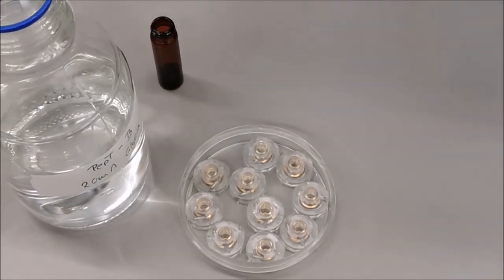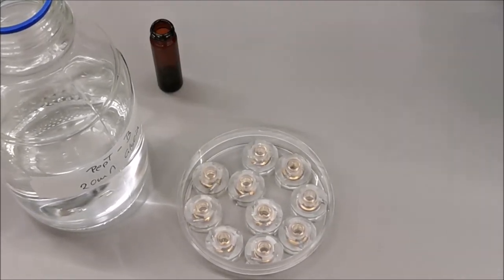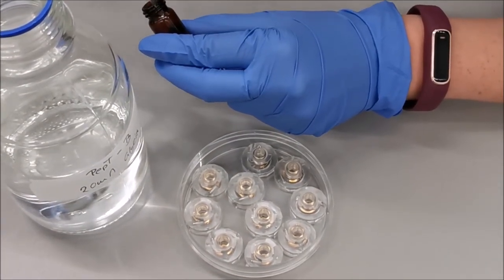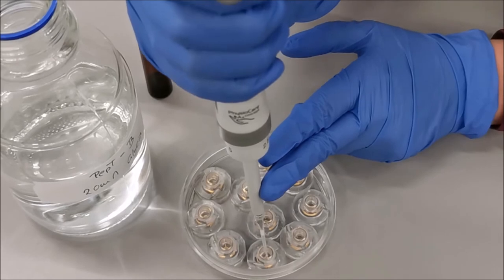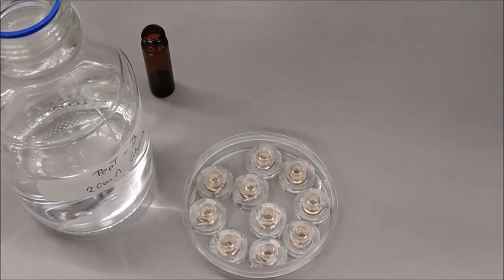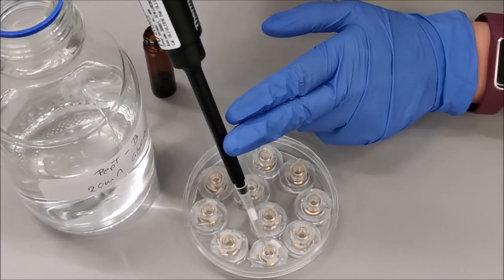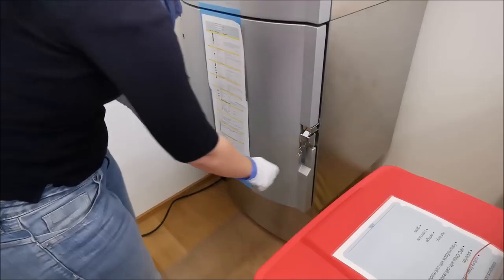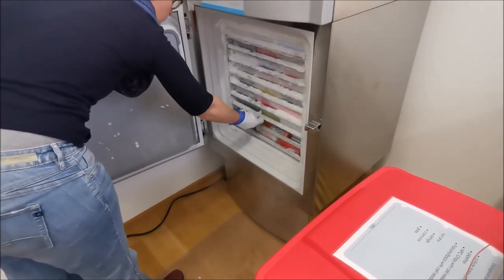Directly after adding the lipid, we add the non-activating solution. The SSM then forms spontaneously. The composition of the non-activating buffer used here depends on the transporter assay. In this case, it's a HEPES-MES combination at pH 6.7. This is the pH optimum for PEPT1. After adding the non-activating solution, the sensor is ready to absorb the PEPT1 sample.